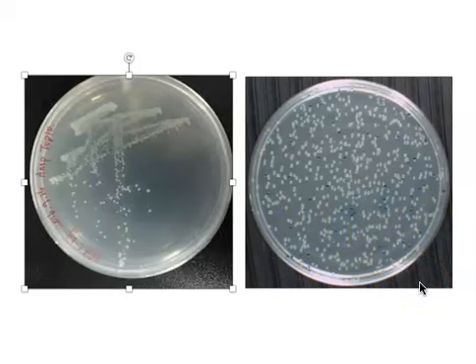The cells that were spread over the surface of the plate will divide while they're in the incubator. And as they divide over and over again, each individual cell creates its own colony of material. So all a colony is a little mound or a little mass of bacterial cells that all came from the same original cell that was placed on the agar plate.